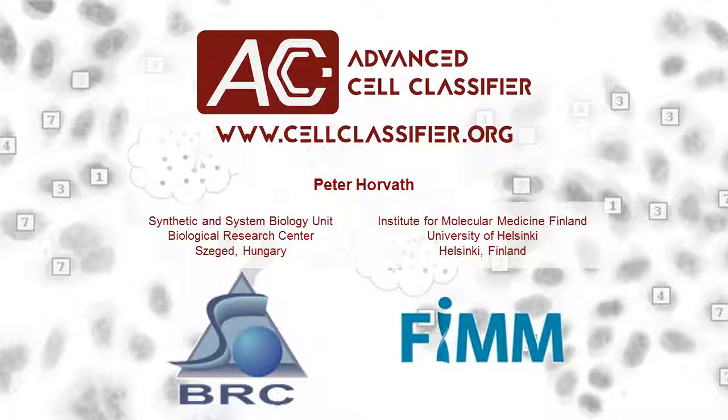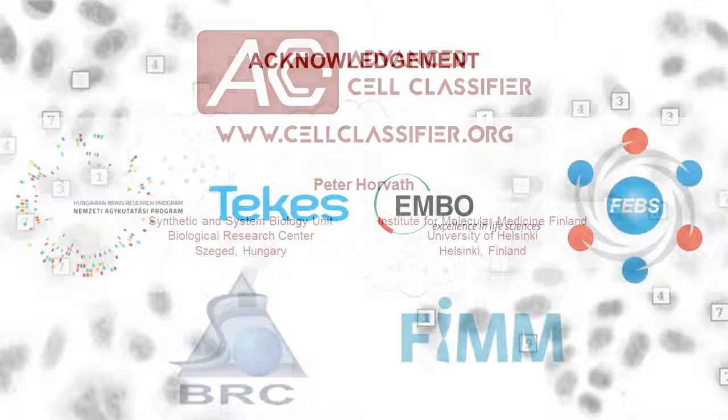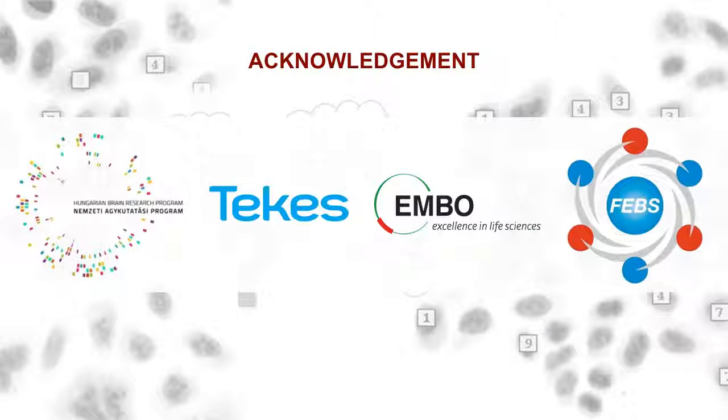Now you have gained insight into Advanced Cell Classifier's report generation methods. To learn more about the different output files and parameters available, please read the help documentation file provided with the software. Thank you for your attention.